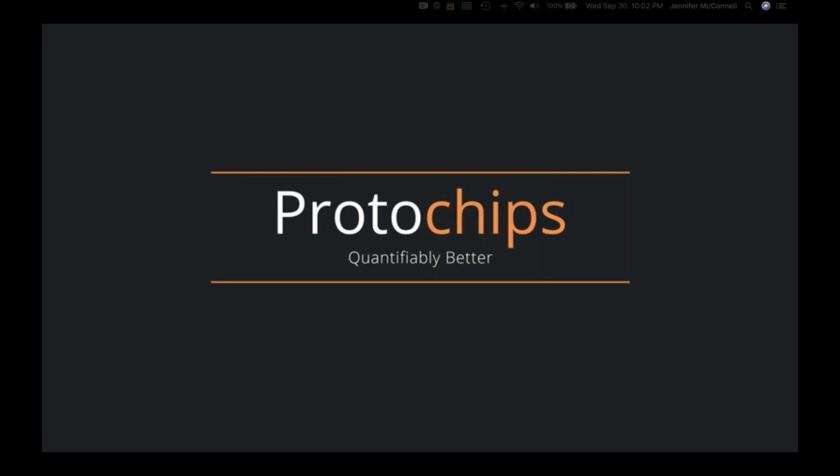Today we're going to do something a little bit different than we've done in the past. This is a short webisode on how AXON can be used to help facilitate remote collaborations in the TEM lab.